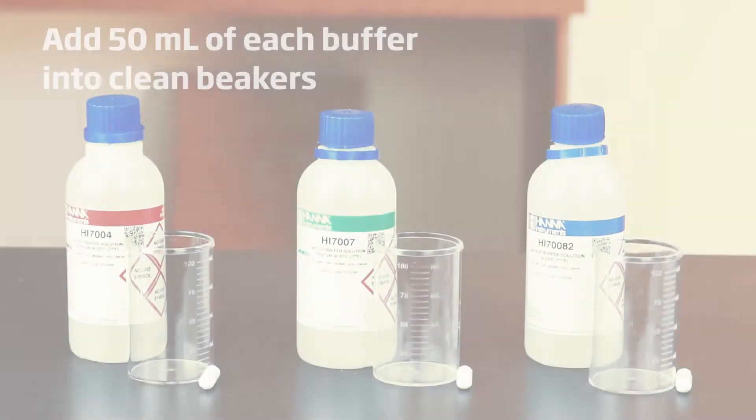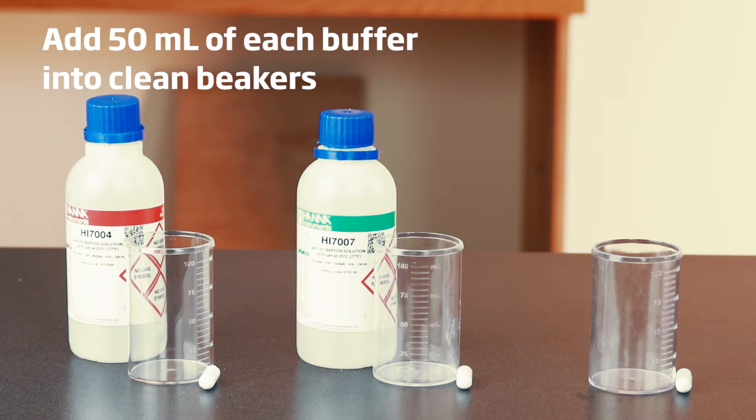Before we take measurements, we suggest daily calibration of the electrode and the pump for best results. This simple, two-minute process helps you ensure accurate results. Here's how we do it.